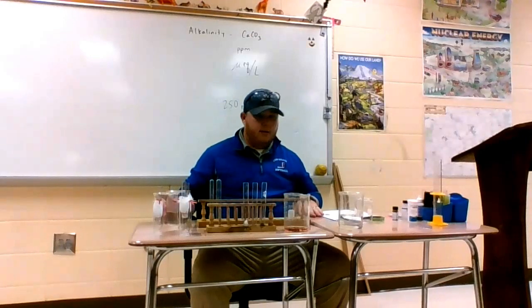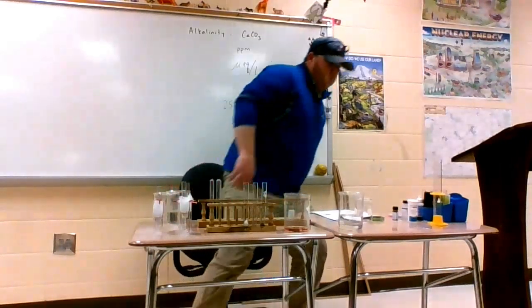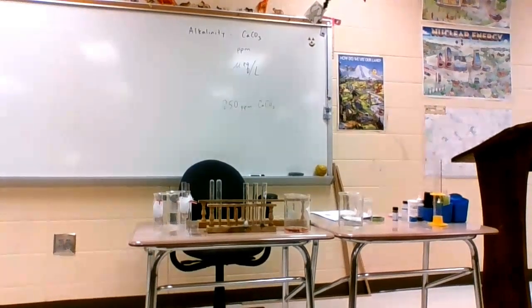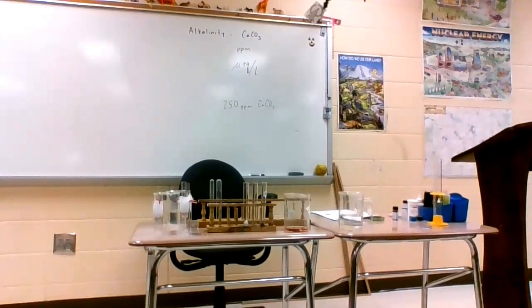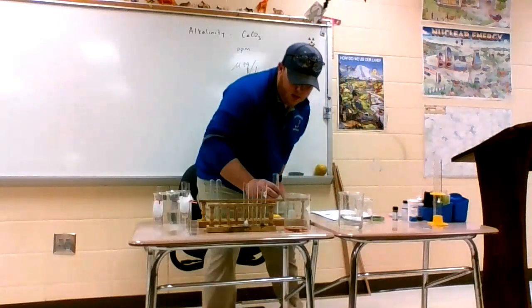It says to pipette 5 milliliters, but I'm going to grab a graduated cylinder. And I'm just going to do 15 or so through each one.